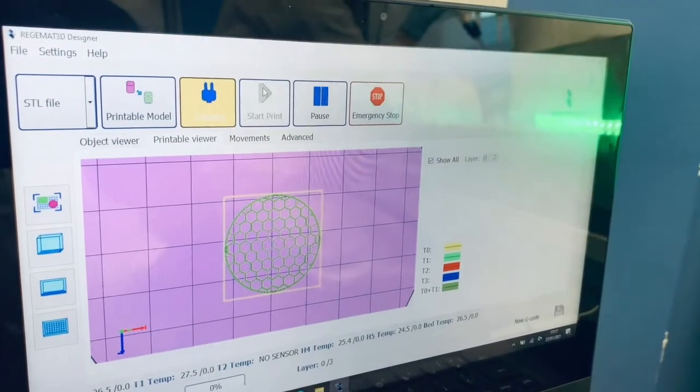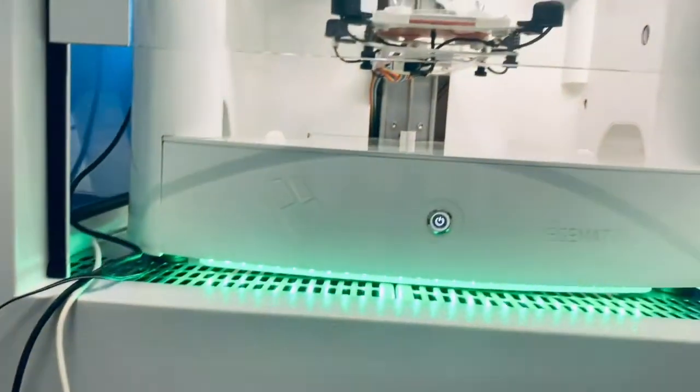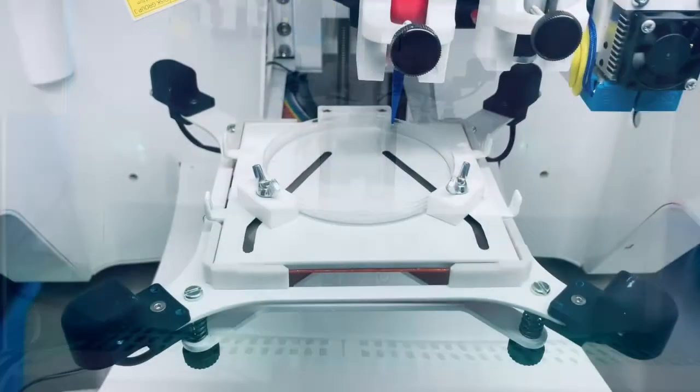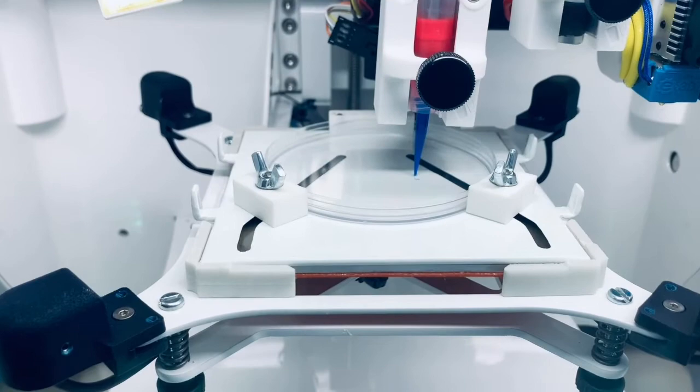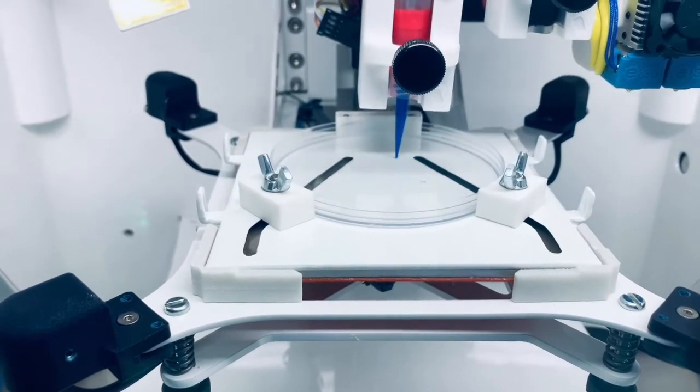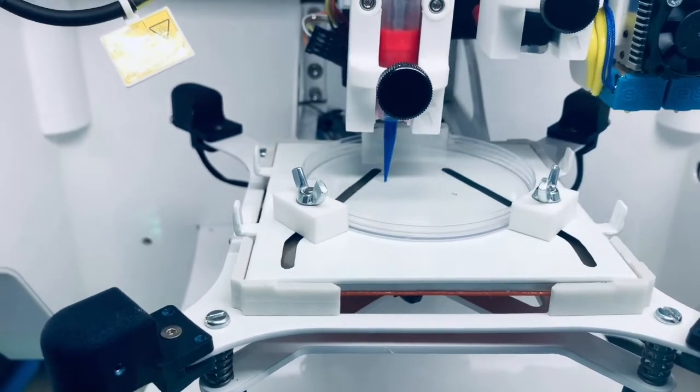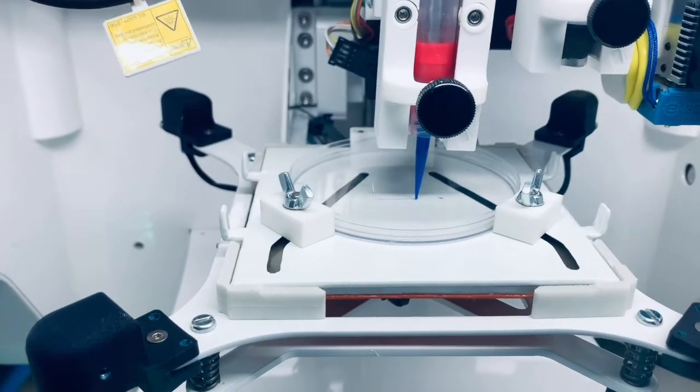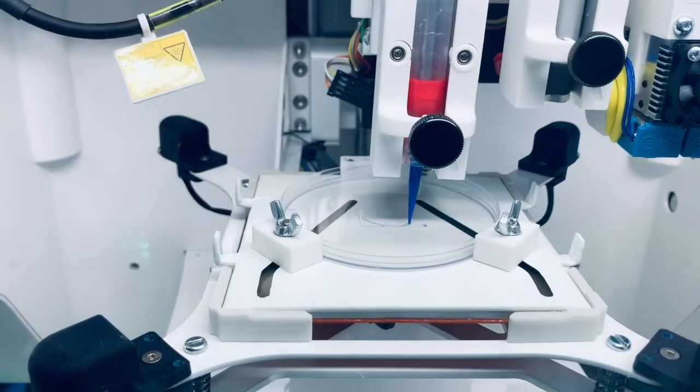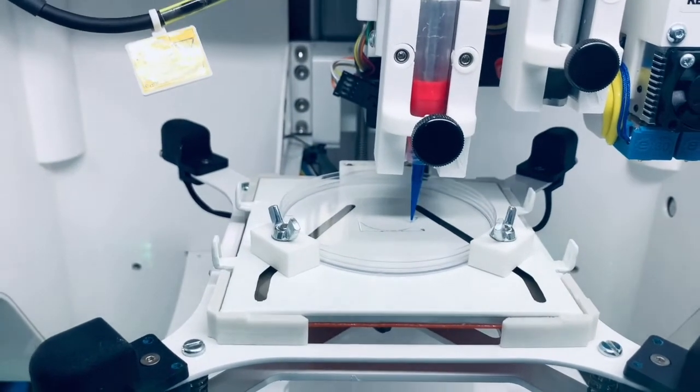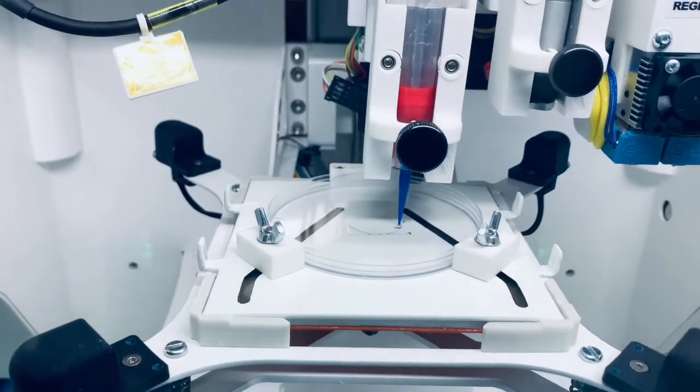The nozzle you see in this video has a diameter of 250 micrometers, but we also provide other types of nozzles, including metallic ones of diameters as low as 150 micrometers.